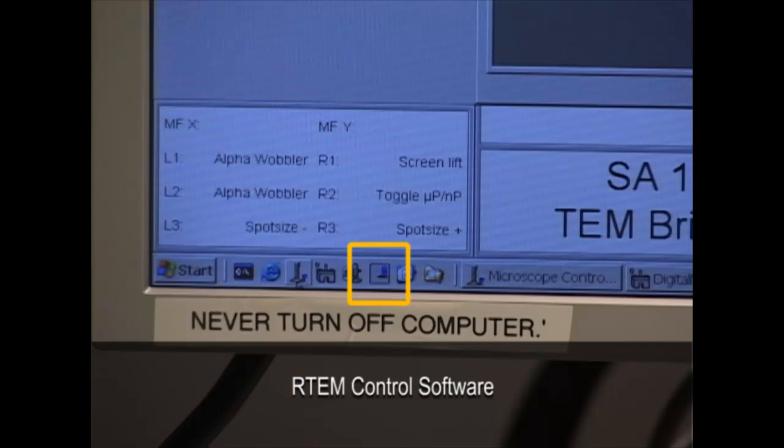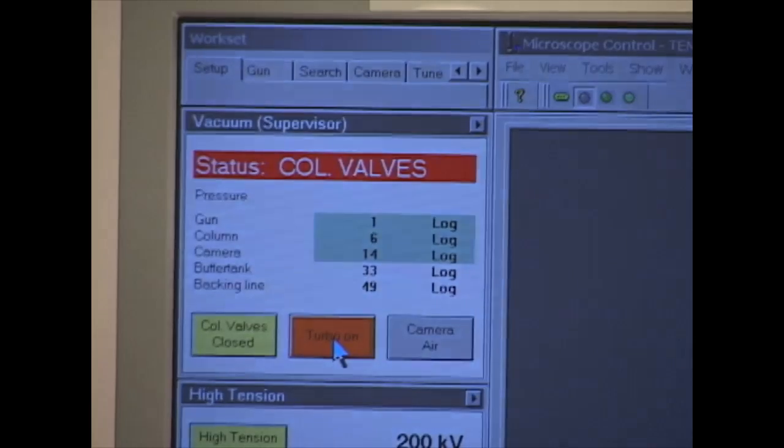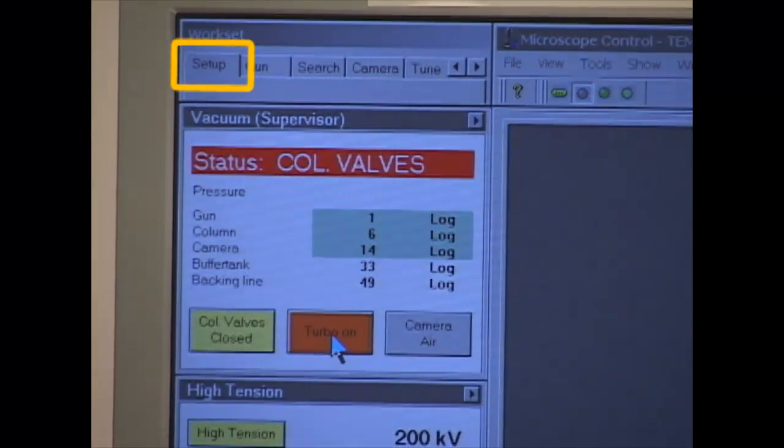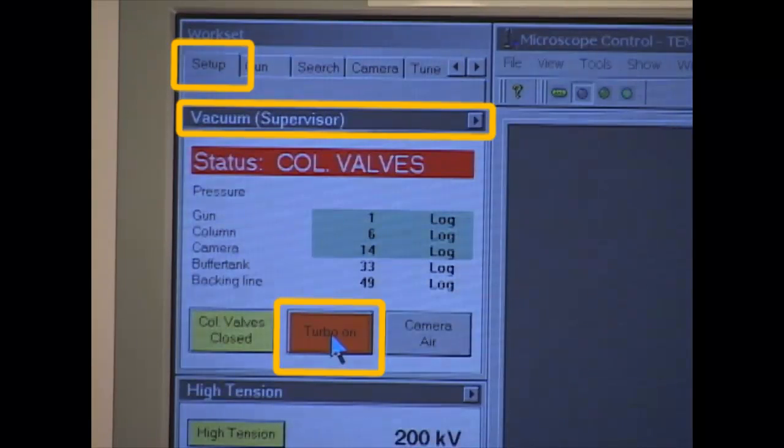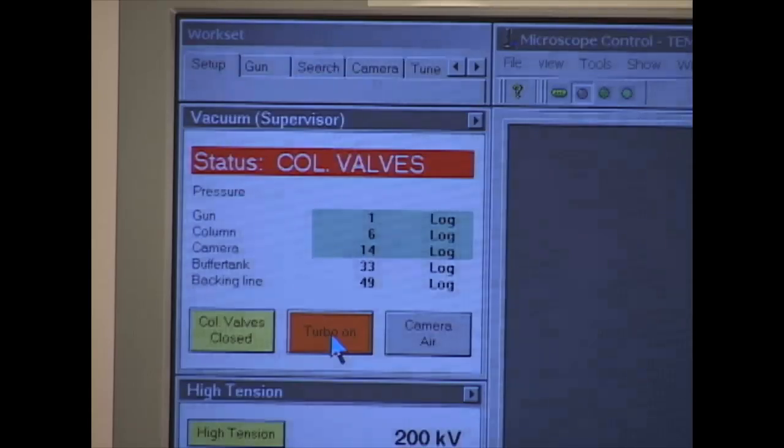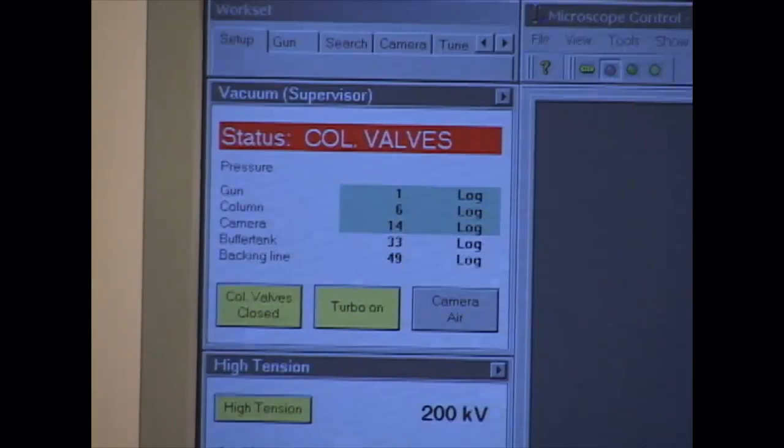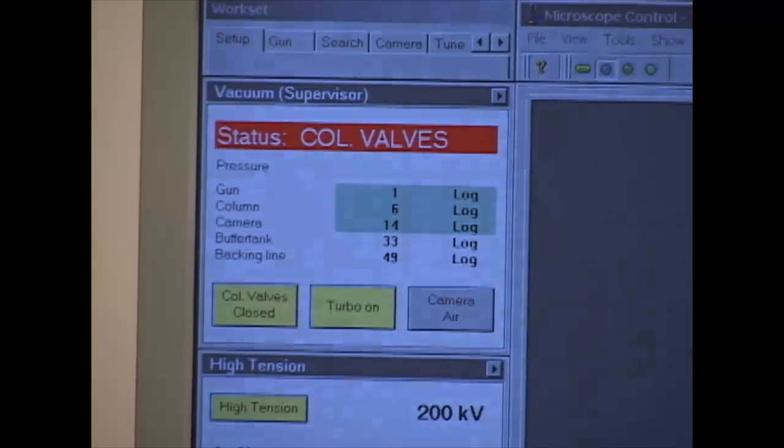The last software is the RTEM control. Select Setup, Vacuum, and Turbo On, and hear the vacuum pump sound. After three minutes, the Turbo On box changes to yellow.